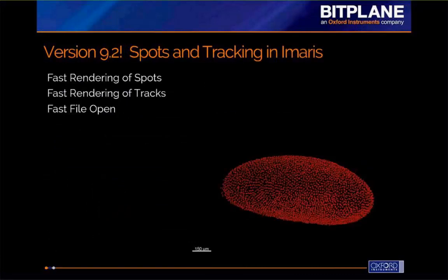With version 9.2, released last week, our development team turned their attention to the spots and tracking tools. The spots tool is commonly used to detect things like vesicles, nuclei, cells, and other round or spherical objects. It reports counts, intensities, and spatial positions for detected objects. Spots is also commonly used with time-lapse images for tracking. Now with Imaris 9.2, you can use these tools to analyze and visualize spots and their motion in terabyte-size images, including very long time lapses.